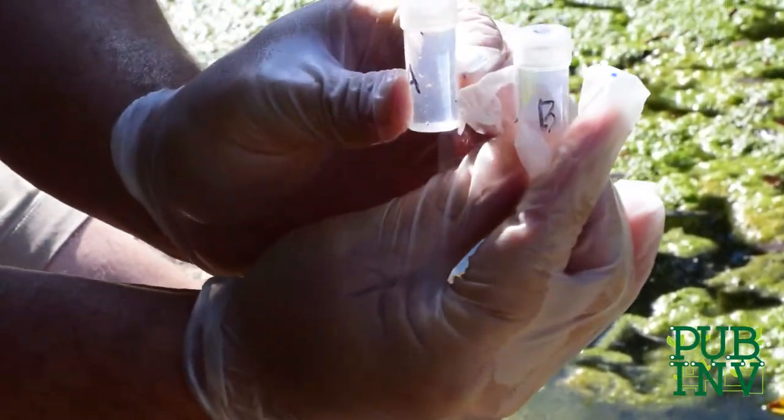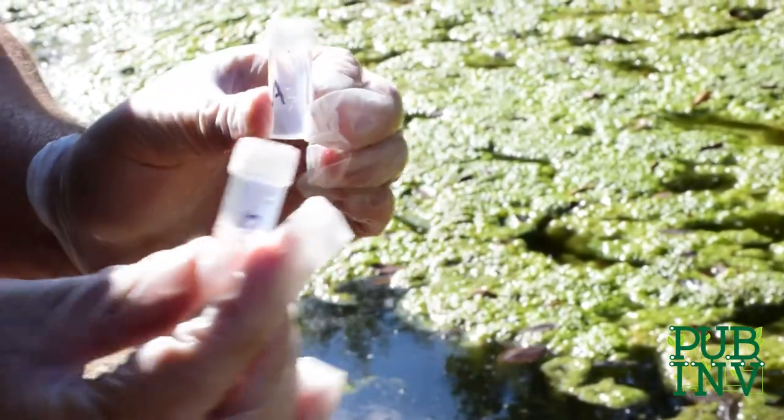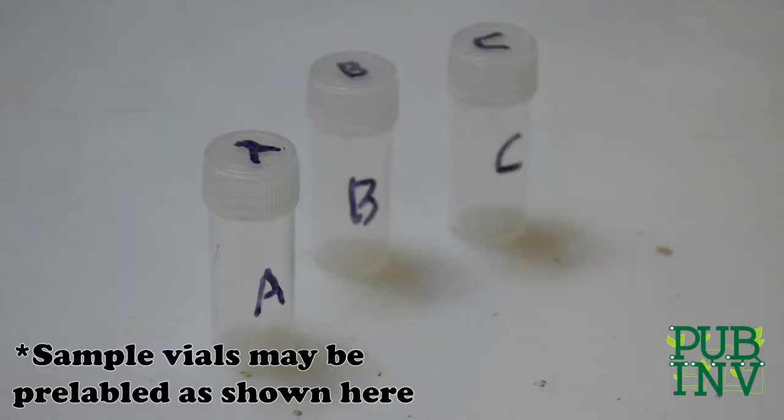Label the top one of your filled vials with an A and the other one with a B to keep them distinguished for the later steps. If the sample vials come pre-labeled, you can skip this.